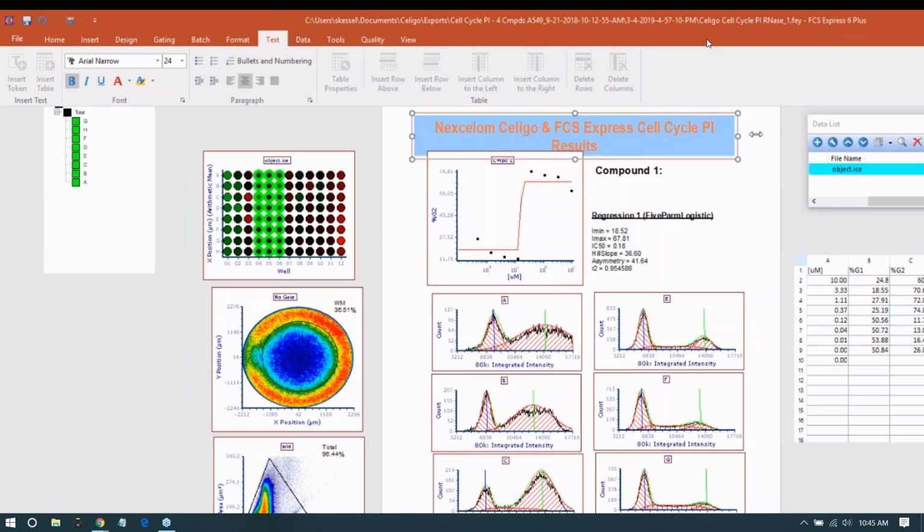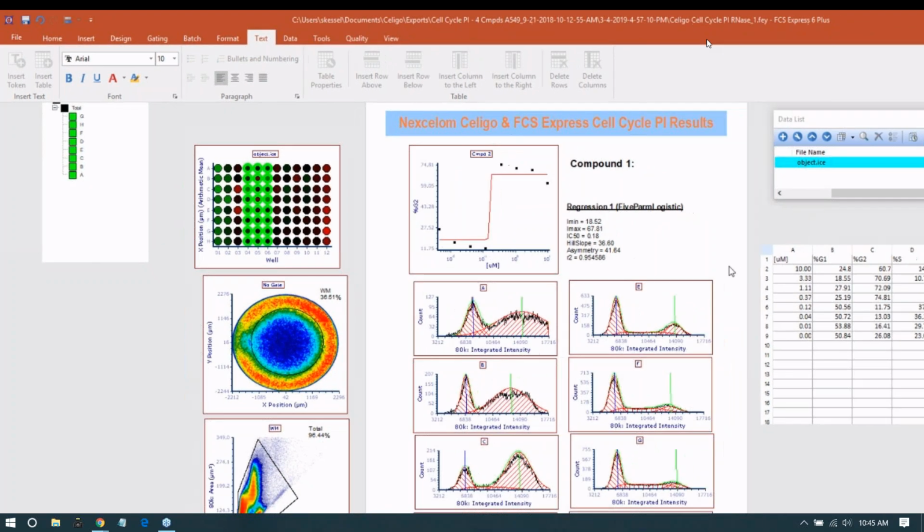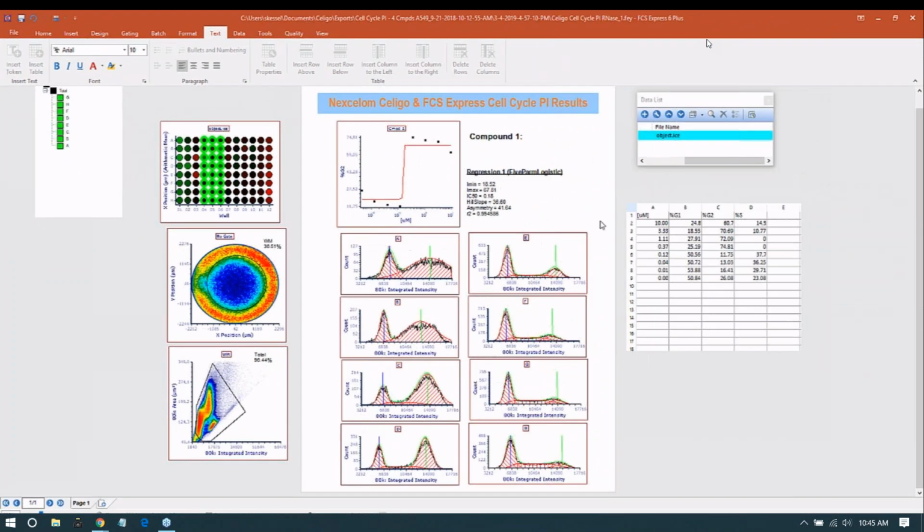So if you're going to save this as another template, you remember the process that we went through to get to the template. You created a panel first, and then you saved it as an unlinked one. If you want to save it with the data, then you want to do it with linked. So now I want to repeat this process for all 4 of the compounds. In order for me to do that, I need to repeat the process and also create well gates.